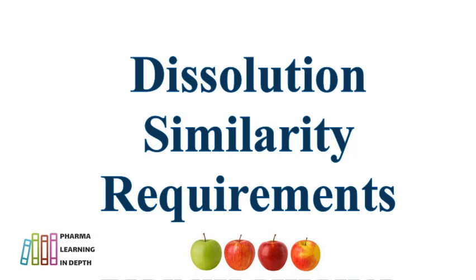It is also known as comparative dissolution profiling or CDP, or sometimes it is called the multimedia dissolution similarity demonstration. I have made a video on multimedia dissolution also, so you can visit that video. In the present video, we will talk about the dissolution similarity requirements: when you can say that the dissolution is similar and what the key requirements are.